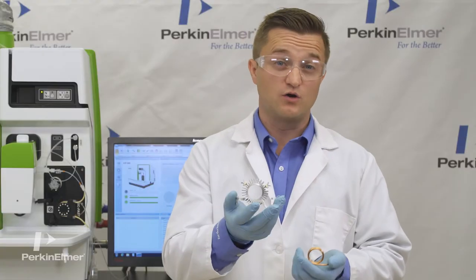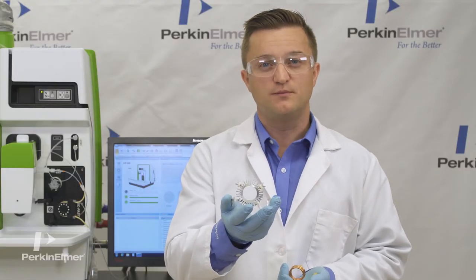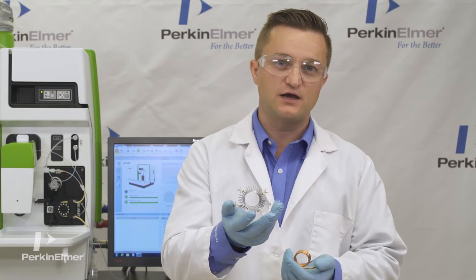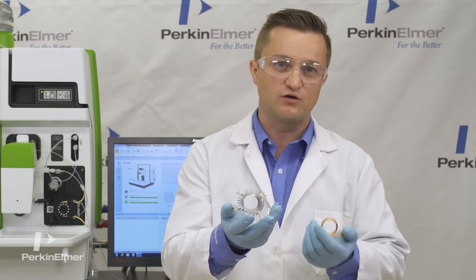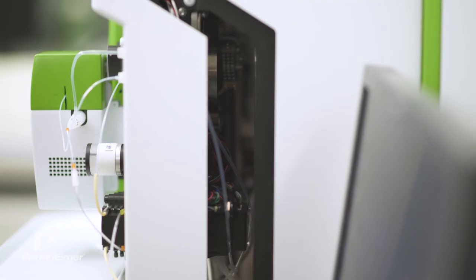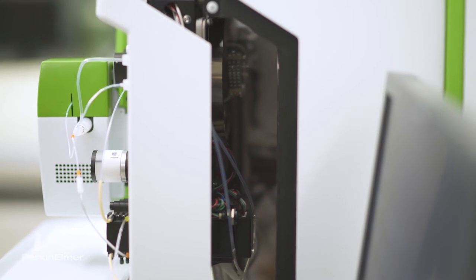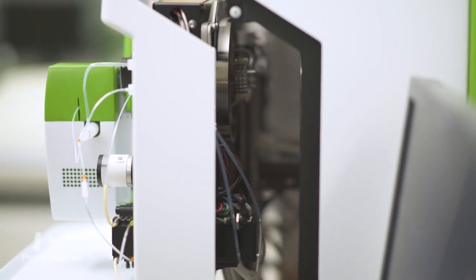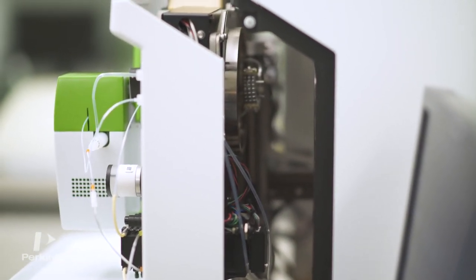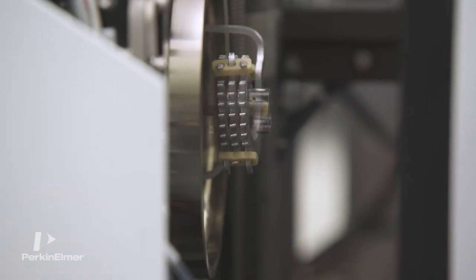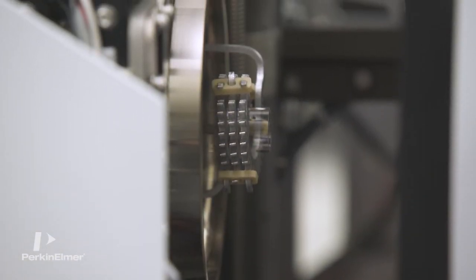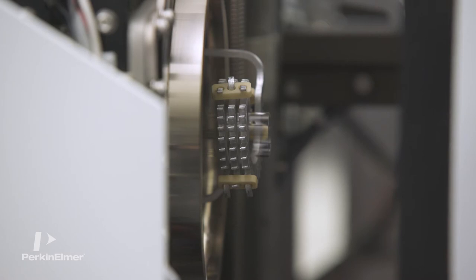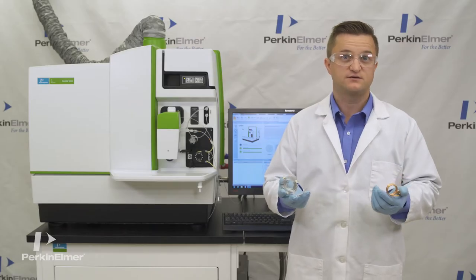The innovative luma coil is made of high-quality aluminum and has a larger surface area than a copper helical coil over which to dissipate heat. Consequently, the luma coil does not require any cooling. Even under operation with maximum power, it looks new with no signs of aging. As a result, there is less instrument downtime and fewer service expenses.